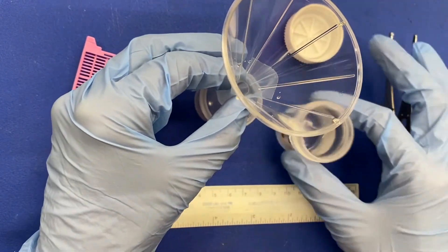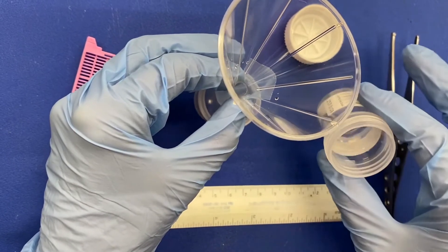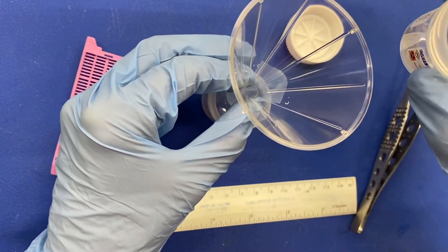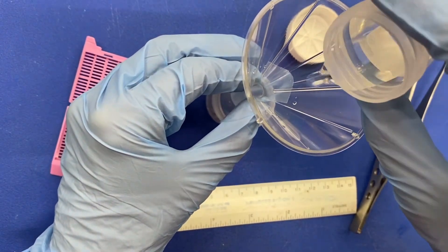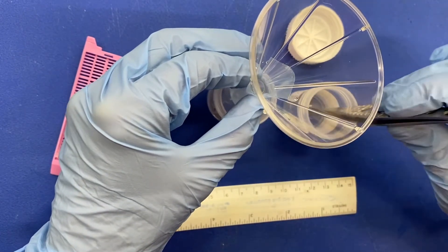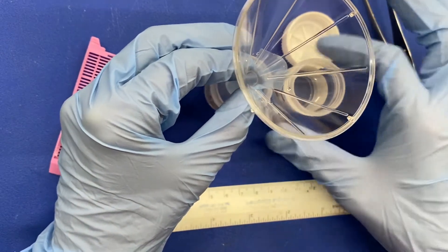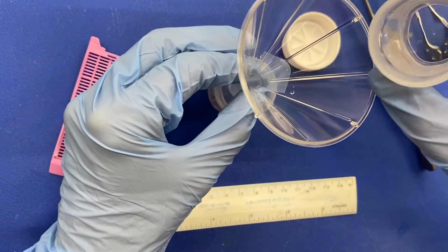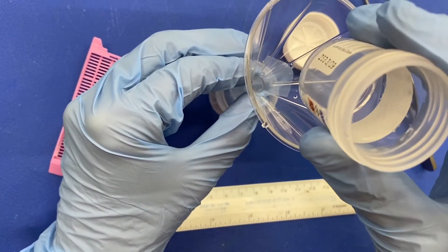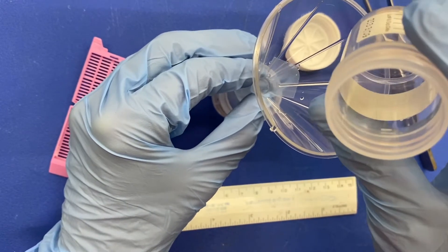Gently swirl your specimen container and pour the formalin with the biopsy in it into the biopsy bag. Check the biopsy container for any remnant tissue inside the container.